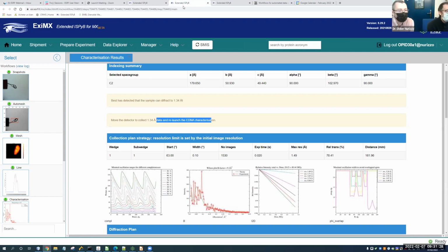As soon as this is done and we start the experiment, before saying anything, automatically, as soon as we start your time, you receive an email. And if it's defined in the sample sheet, as soon as we start your protein, and you are not the bag responsible, you also receive an email saying we start your sample automatically. So you know when this is started and what time we are doing the job.